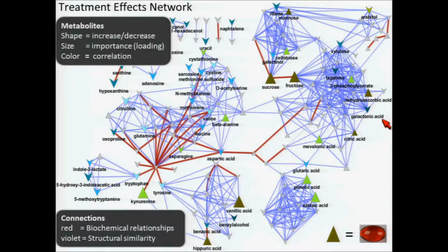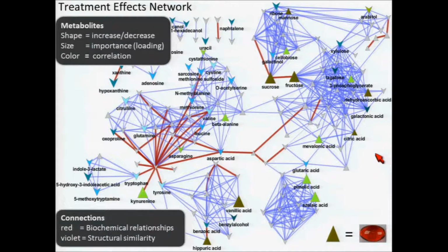Very quickly, you get a common theme. Essentially, all of these are very strikingly identical to the compounds of cough syrup. In this case, the vehicle for our treatment was cough syrup, which contained the drug of interest. As chemists, we might not know that the biologist worked this in, and the biologist never thought about giving us some cough syrup to analyze because this is like a method blank. But here we've determined that, and this is important because now we can set the signal aside. This is an analytical signal. This is noise. This is uninteresting biologically, and now I'll focus on the biology.